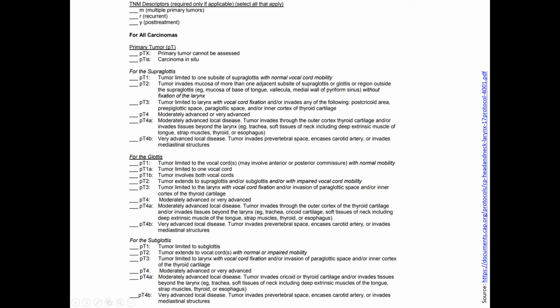Let's see, sections of trachea. I think the ENTs here are a little more conservative than other places I've been, where I'd get 5, 6, 7 rings, maybe more, like a lot of trachea.